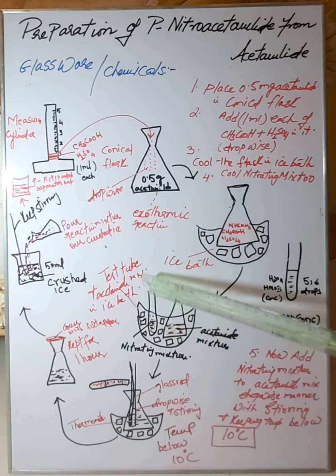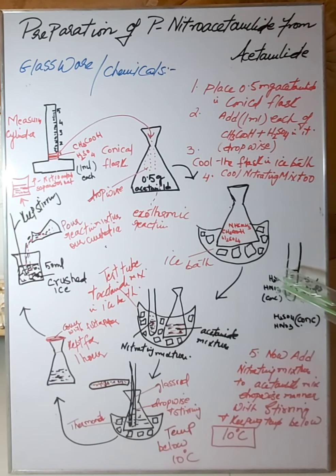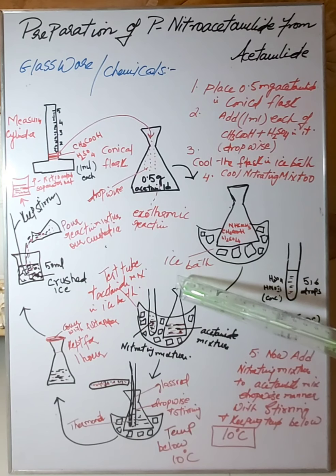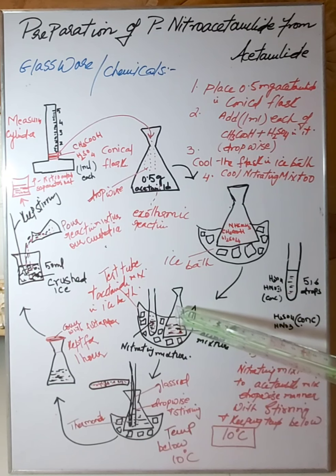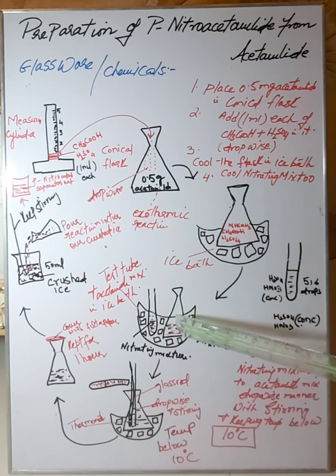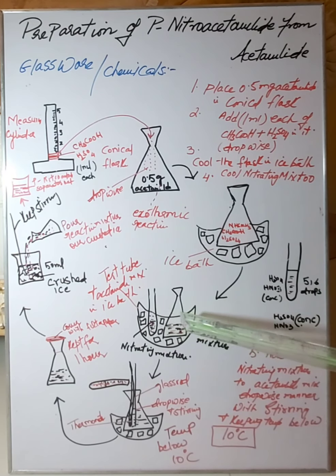This is a mixture of sulfuric and concentrated nitric acid, and we call it a nitrating mixture. So now you are going to add this into the acetanilide mixture in a dropwise manner, slowly and gradually. You have to mix them slowly and gradually, and you have to maintain the temperature.